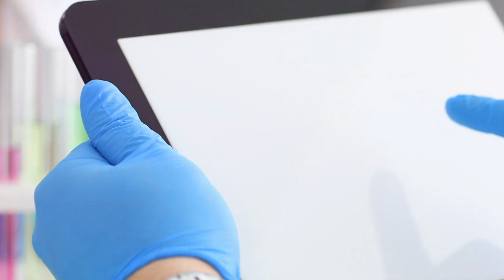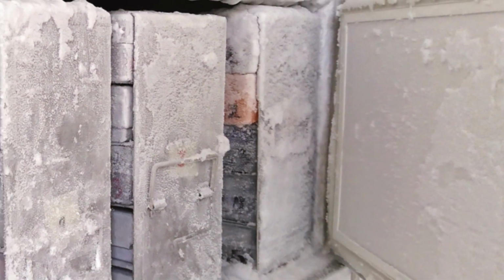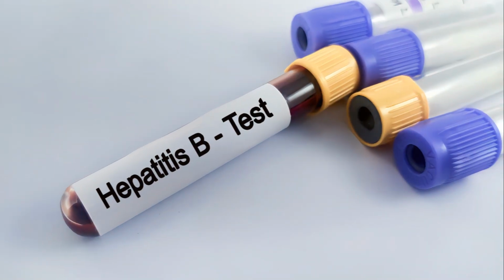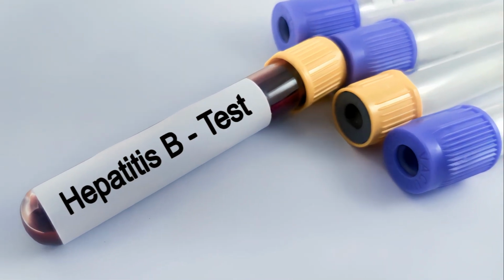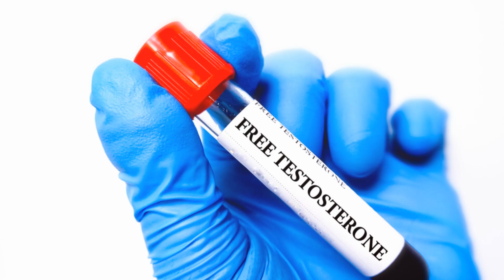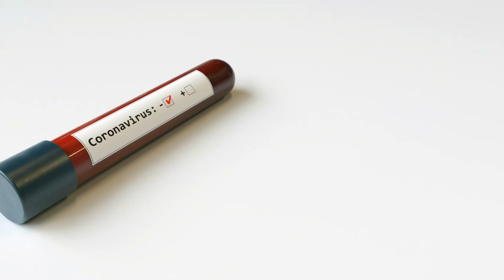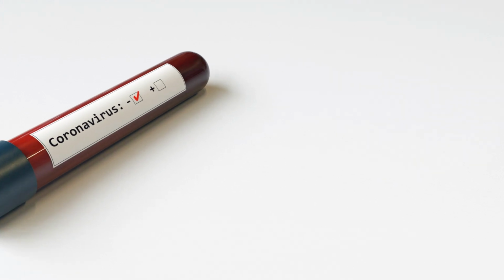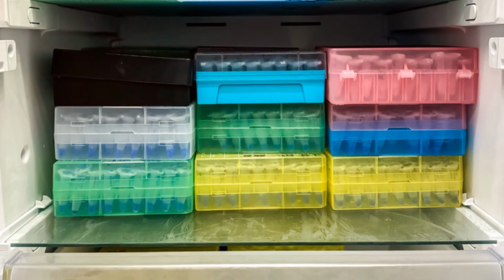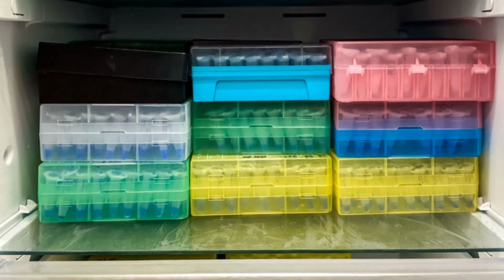After receipt and verification, samples must be stored appropriately until analysis to prevent any degradation. Different sample types have different storage requirements which must be strictly followed. Some samples might need to be refrigerated or frozen to maintain their stability, while others can be stored at room temperature without any issues. ISO 20658 emphasizes the importance of adhering to these specific storage conditions to preserve sample integrity and prevent degradation, ensuring reliable test results.